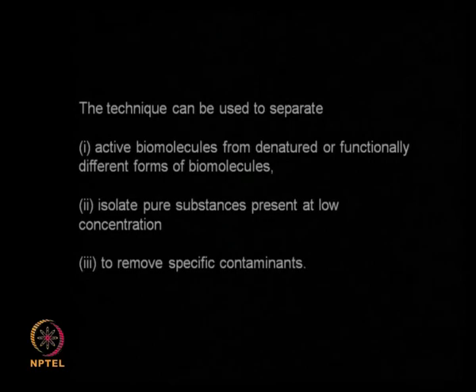It is very expensive because you need to have a complementary protein or ligand and then you need to immobilize that. So it is an expensive technique when compared to other techniques. So generally we use it for pharmaceutical products only and not for bulk chemical product.